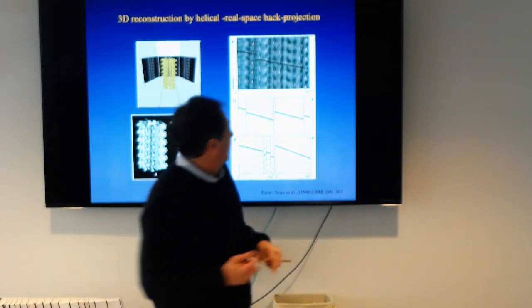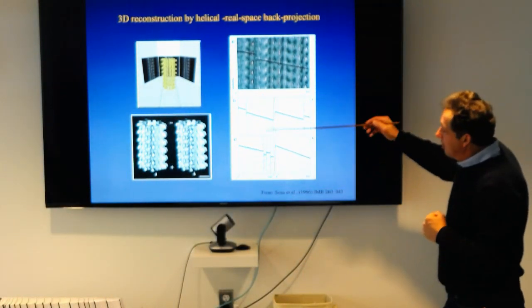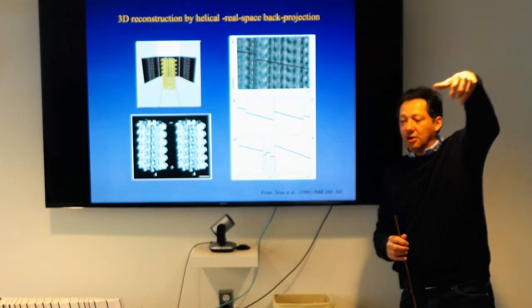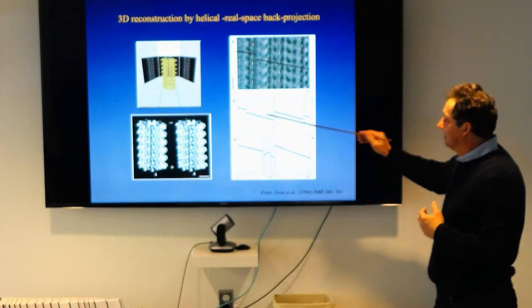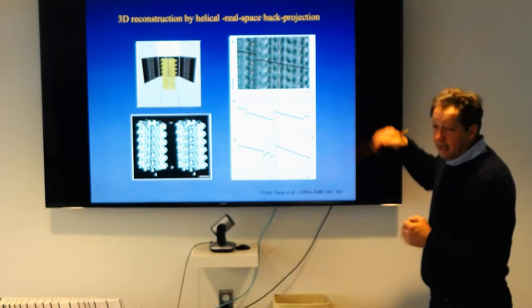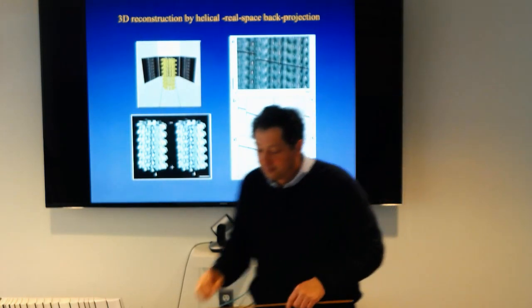And that's an example of this early effort. You could see the seam because we took very long filaments and had the whole rotation of the protofilaments along them, and reconstructed using this method. We found that within it we have not one but many helical discontinuities, depending on the filament.